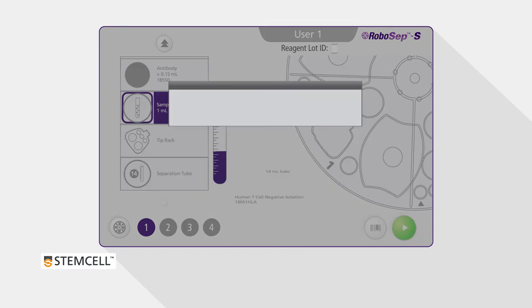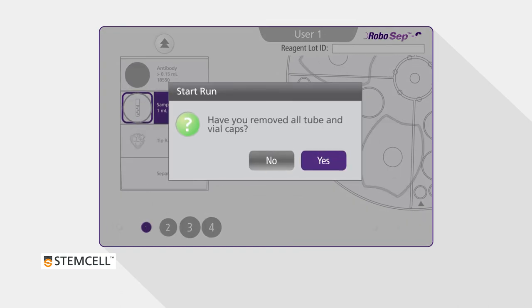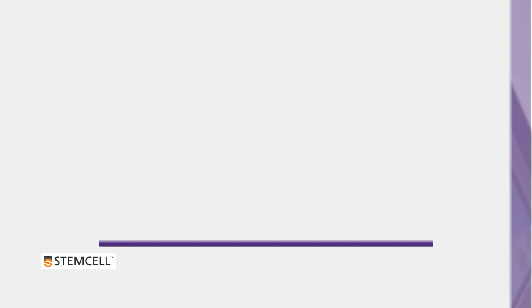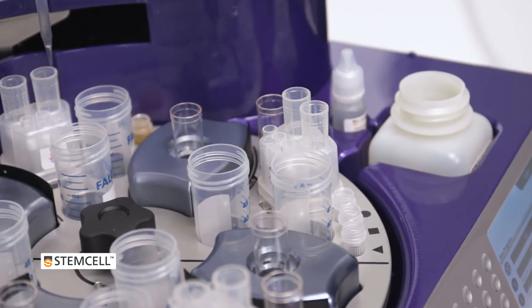The next screen will ask if you have removed all vial and tube caps. Click Yes. RoboSep will now run the selected protocols.